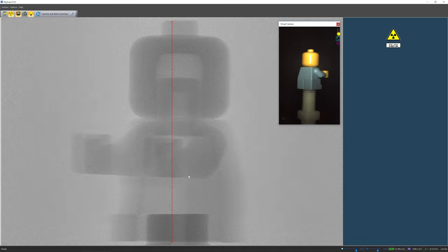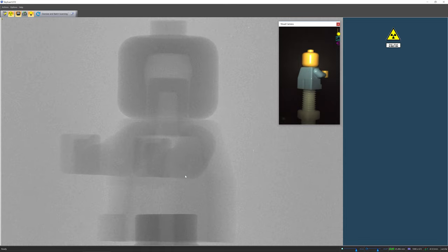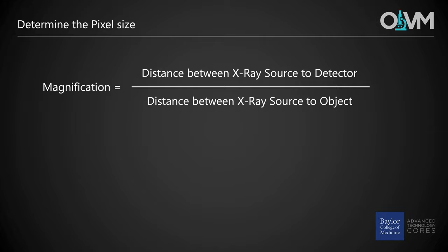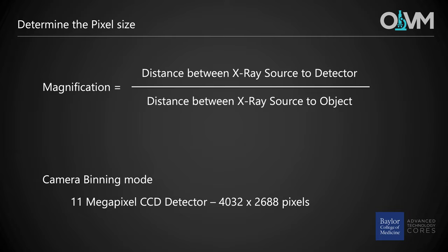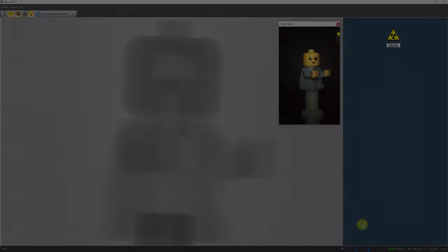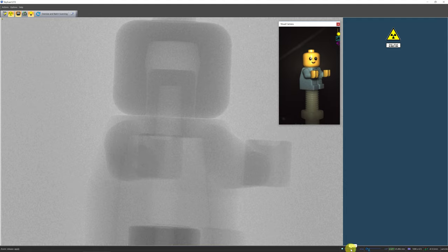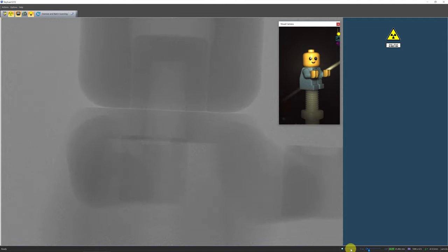Once the sample is aligned, bring the rotation back to 0 degrees and proceed with determining the desired resolution for imaging your sample. The pixel size on the Skyscan 1272 is determined by setting the zoom and by setting the x-ray detector's camera binning mode. First, adjust the pixel size to the lowest possible while the entire sample can still fit completely inside the detector's field of view. In the status bar, locate the pixel size column, move to the desired pixel size on the scale and click the left mouse button. The system will automatically adjust the sample and camera position to reach the desired pixel size.